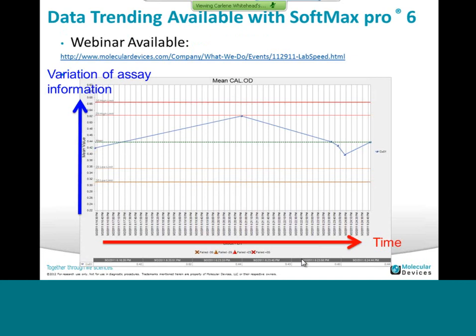So now I'm just going to close this webinar with a small conclusion. There is now some data trending available with SoftMax Pro 6, and this is done with third-party software. Some protocols have been developed in SoftMax Pro 6.1, so the link between the data and the trending software can be done very easily. So what is data trending for those who don't know? It is the practice of collecting information from an assay, for example, the mean OD, the curve fitting parameters or the EC50, and attempting to spot a pattern or a trend through time.